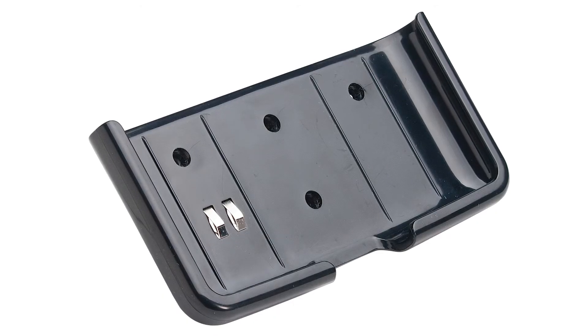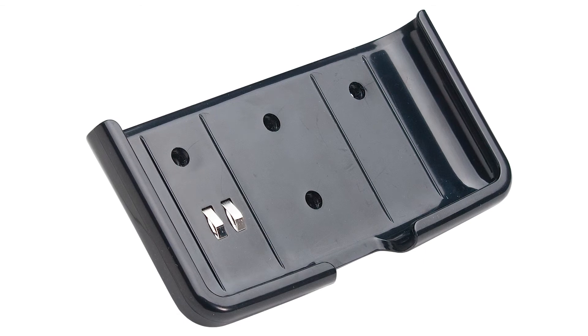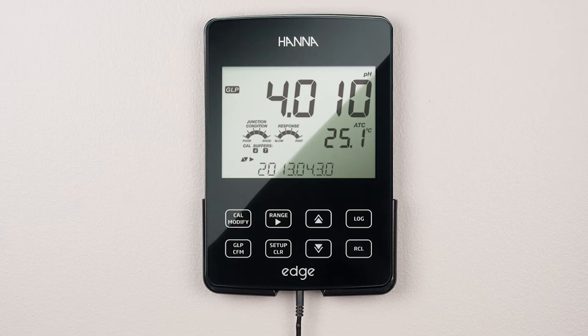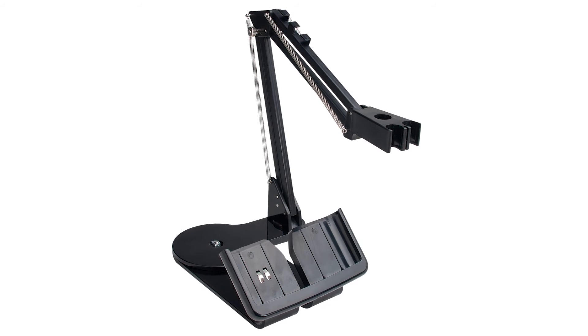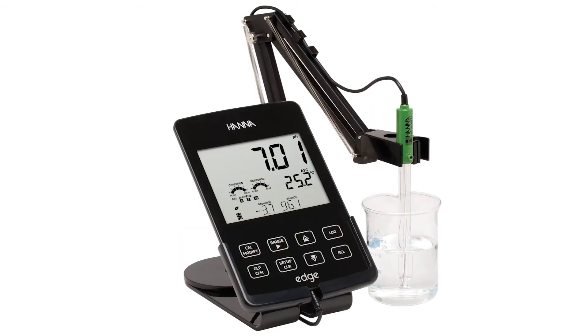Using the included wall-mount cradle, Edge can be placed on a wall, leaving zero footprint on the benchtop space. The cradle has a built-in connector to power Edge and charge its batteries. On the benchtop, the Edge base is equipped with an adjustable swivel electrode holder and holds the meter securely in place at the optimum viewing angle.